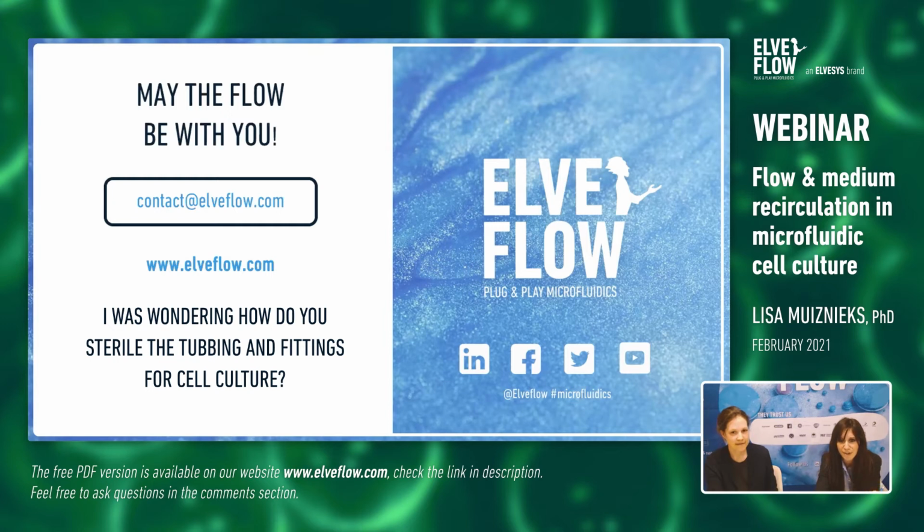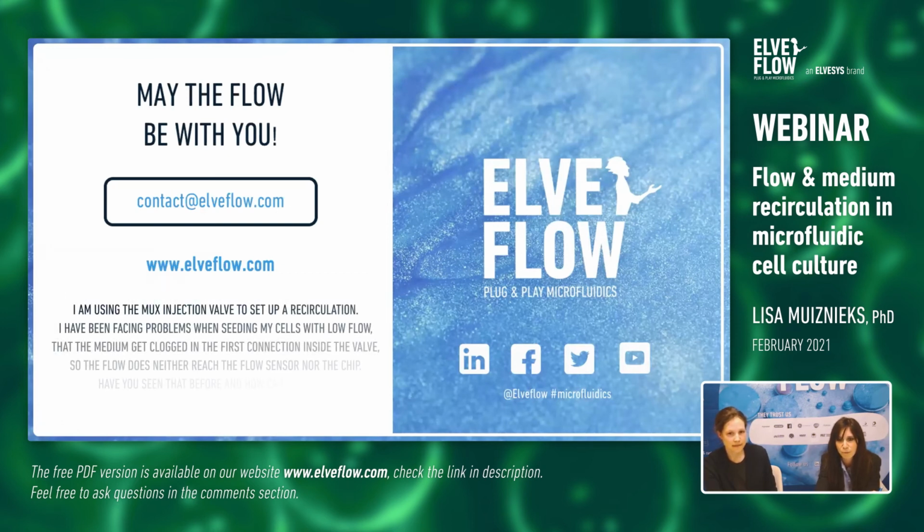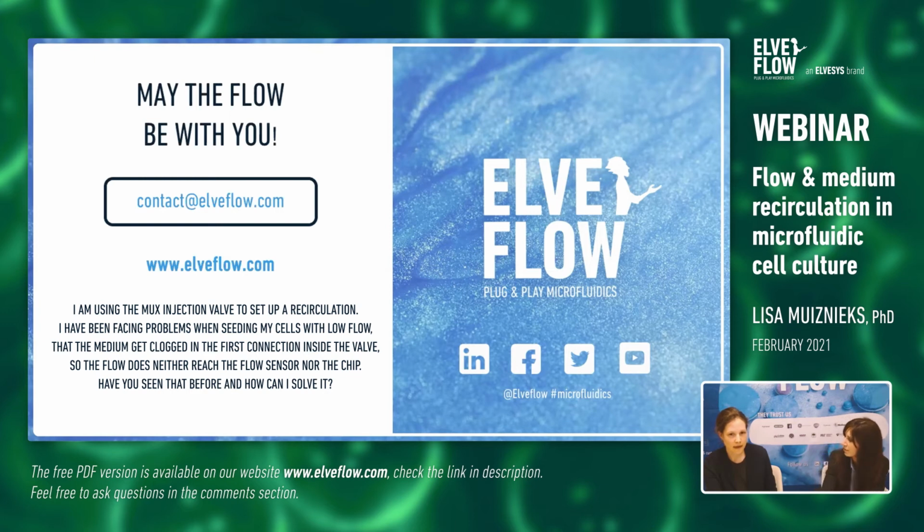Next question. Thank you for the presentation, from Becher. I'm using the MUX injection valve to set up a recirculation. I've been facing problems when seeding my cells with low flow, that the medium gets clogged in the first connection inside the valve, so the flow reaches neither the flow sensor nor the chip. Have you seen that before, and how can I solve it?